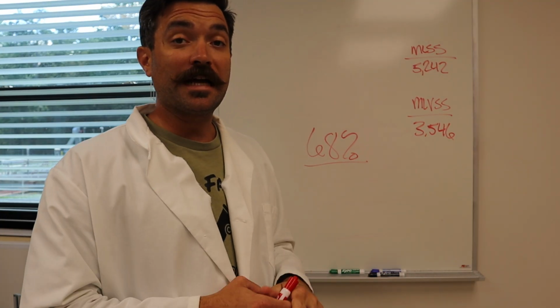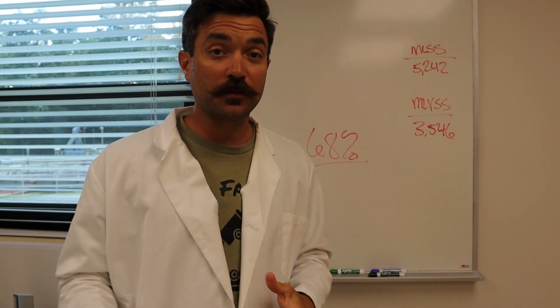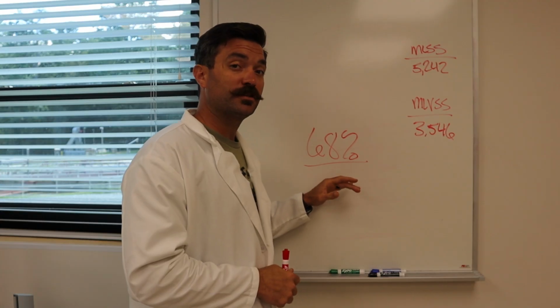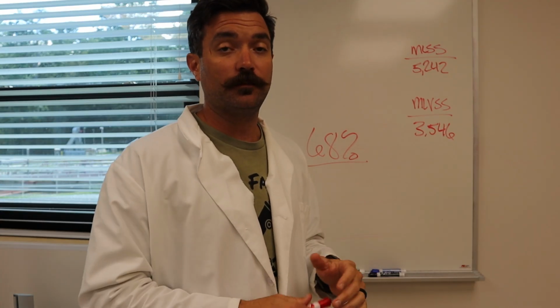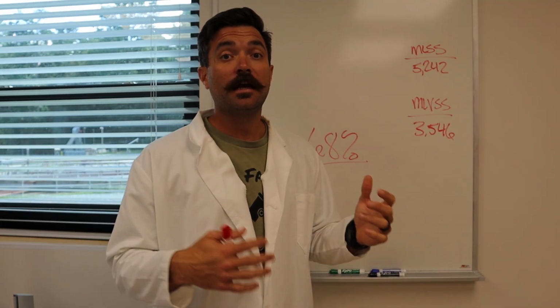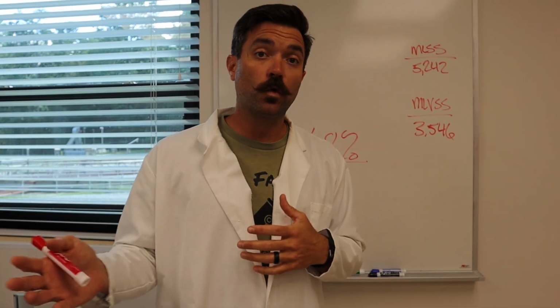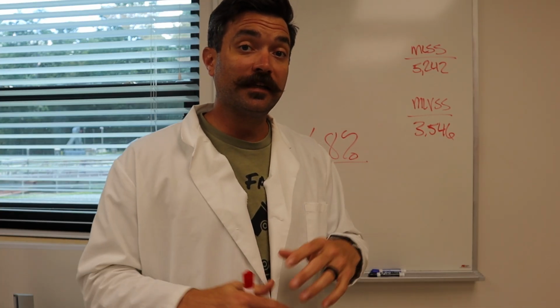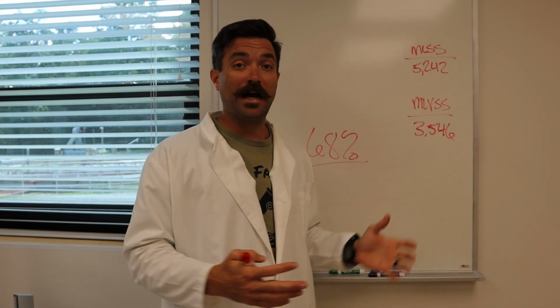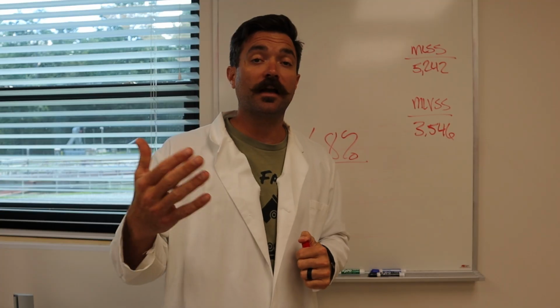And there you have it. That's how you run a mixed liquor. That's how you find your volatile content of that sample, and how you also find your percent volatile of that sample. Three very important numbers to be able to know how to find and use and be efficient for you at your plant and for your process. And not only that, it's actually very good and beneficial for you to understand how to solve and find all three of those regarding exam preparation and knowing how to do that on an exam.